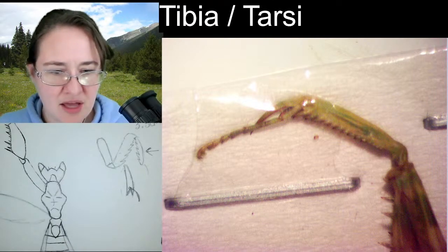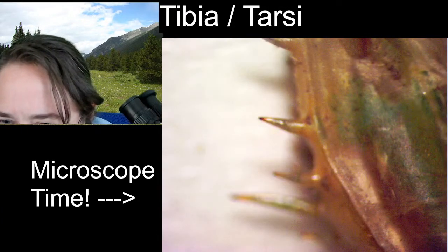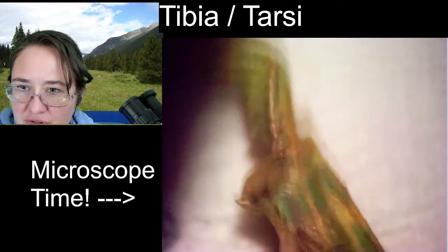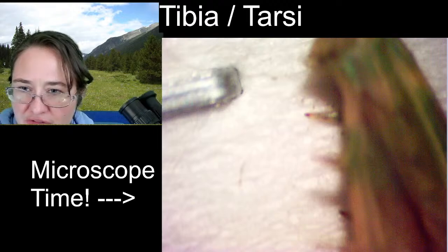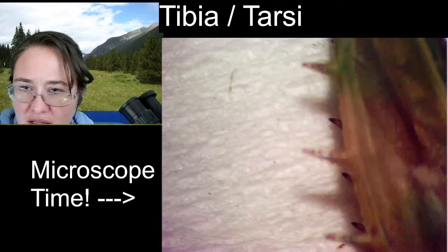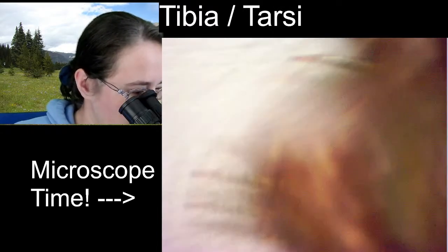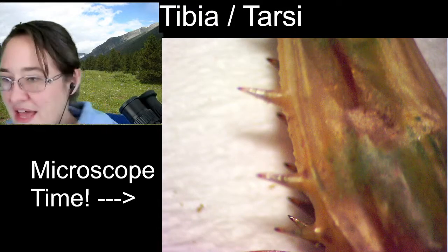You know what, Matthew, you might be right. So if we look up here, it looks like the big ones are the ones that are closer. And then if we zoom down to look at the spines that are a little bit further away, they are kind of hidden down there. I would say there's definitely a variety in size, but I think you're right. The small ones that we were primarily seeing are the ones on the other side.